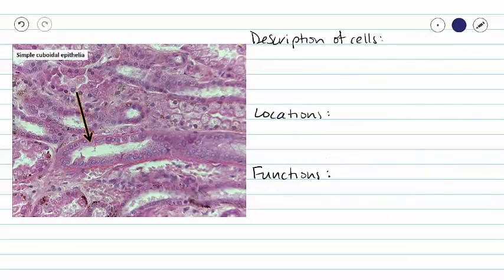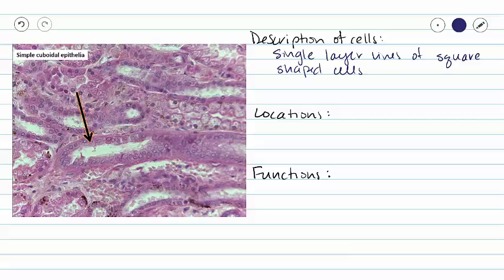Now let's take a closer look at our simple cuboidal epithelium now that we understand the name. Here we see the same picture and in our description of cells, we can say that we have single layer lines of square shaped cells. Our nucleus is going to be beautiful and round and right in the middle of the cell.